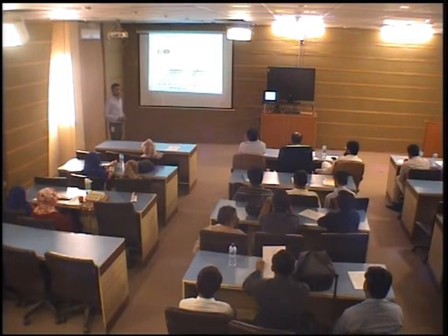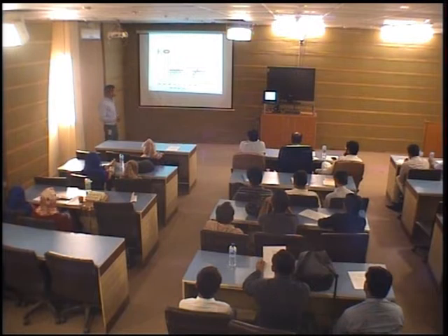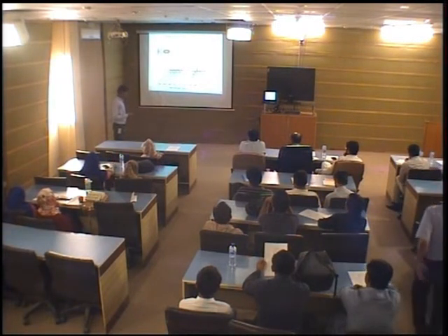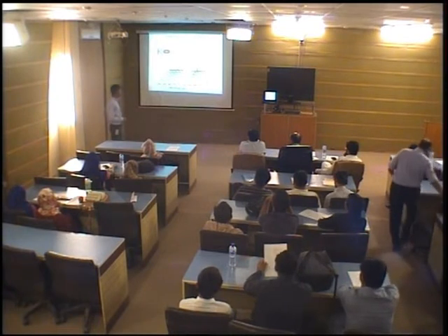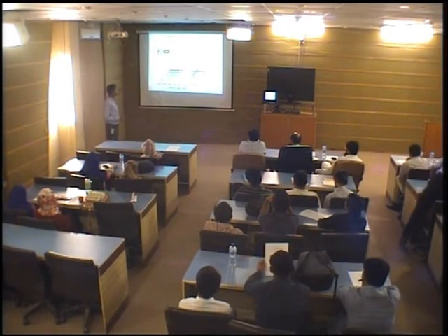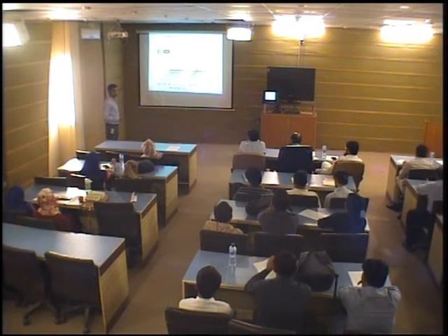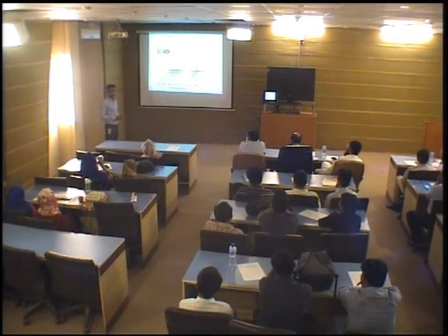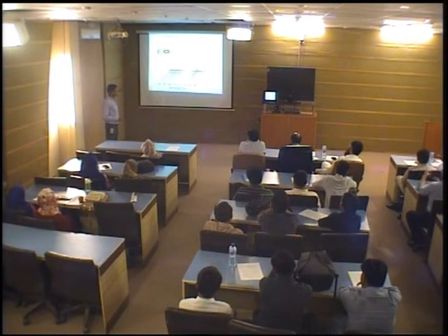Temporal variation of intensity. Temporal variation is basically variation of any intensity with respect to delay time. So this is the 3D graph of corresponding emission wavelength, and this graph shows that as the delay time increases, the intensity of each transition line continuously decreases. Delay time is basically the gap between plasma generation and light collection. This delay time is measured in microseconds.